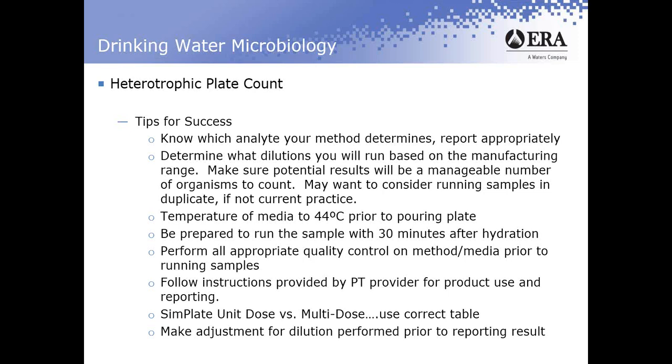Be prepared to run the sample within 30 minutes after rehydration. Remember, you're dealing with microorganisms. Once you've rehydrated them in the buffer, the organisms are viable, and you need to be aware of that. If you leave them in the buffer, the concentration can change. You generally have 30 minutes to 60 minutes to deal with, so just be prepared that when you rehydrate it, you're ready to perform your test. It's quantitative. You want to make sure that it stays that way, so you need to be performing the test in a timely fashion.